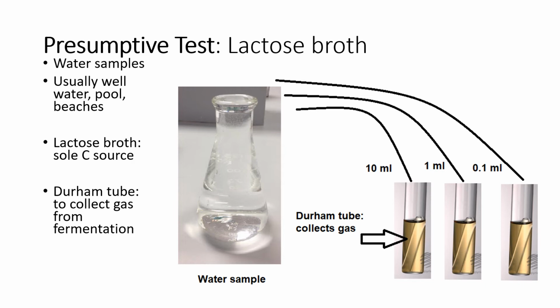And okay, so we would test this water sample, and we would do it in 3 different tubes. Okay, the tubes would have lactose broth. That would be the only thing in here. It'd be lactose and water. Okay, lactose is a sugar, and it's a food source. Okay, lactose broth, it is the sole carbon source. That's the only thing to eat, in other words.